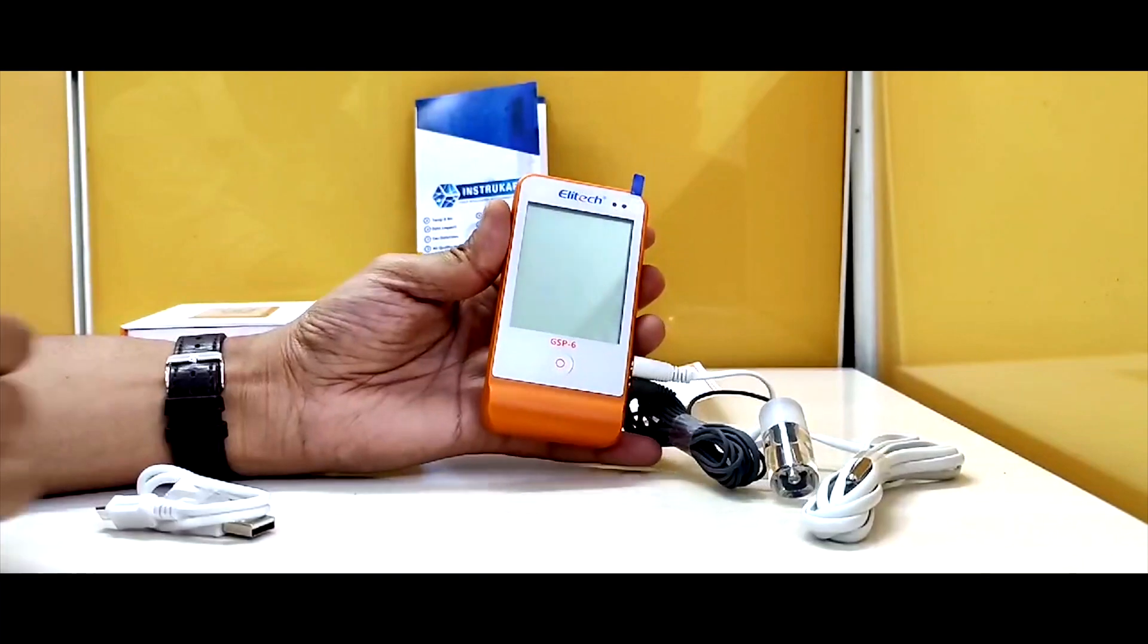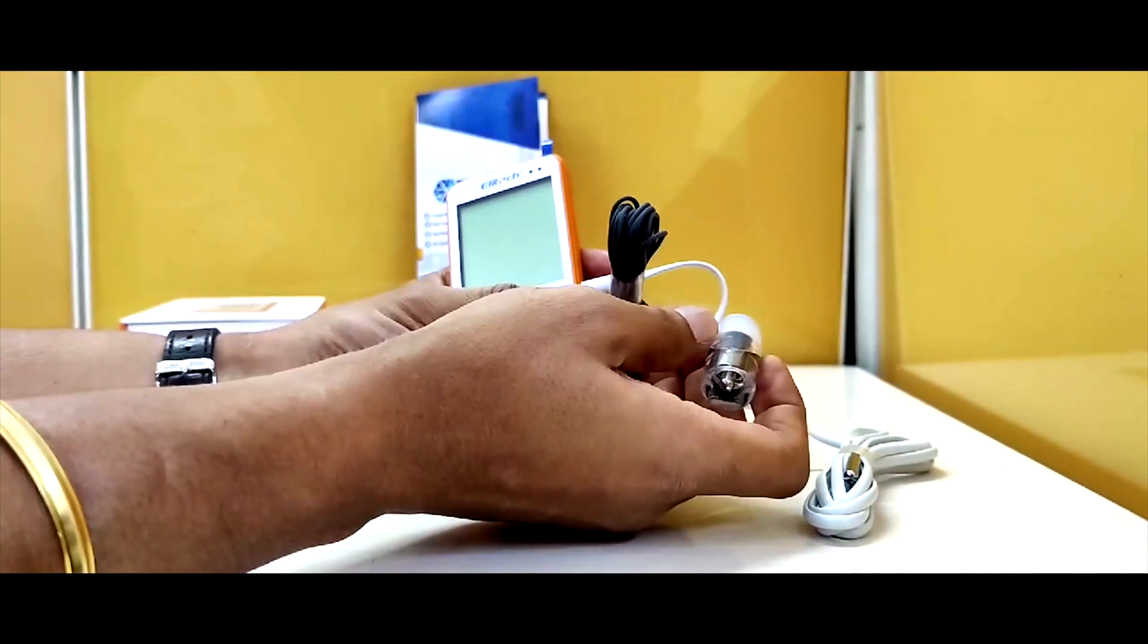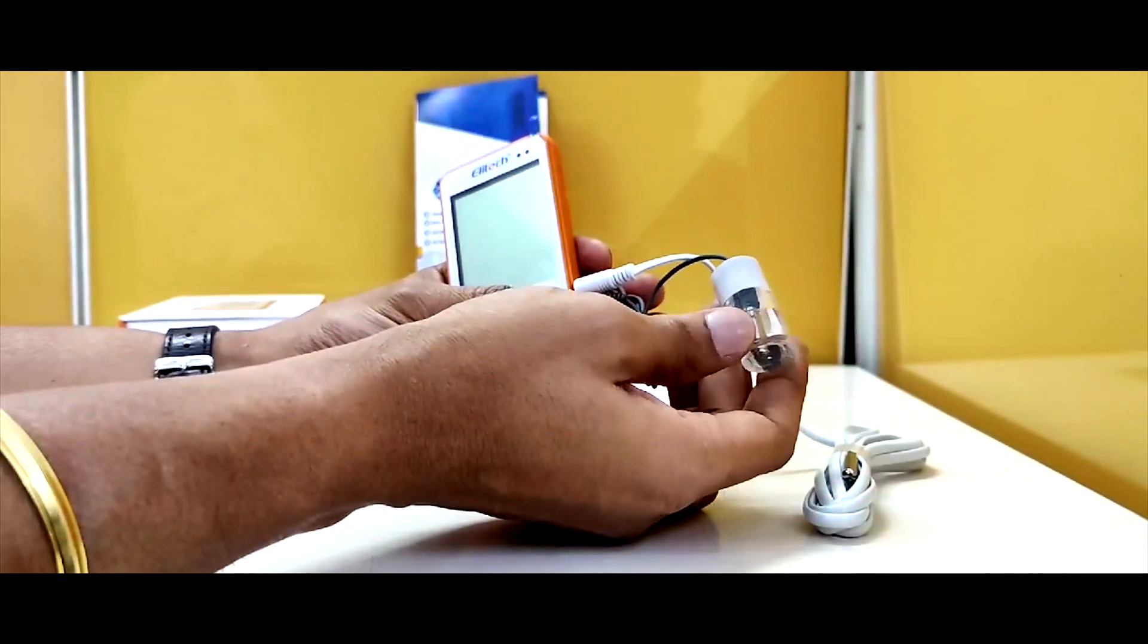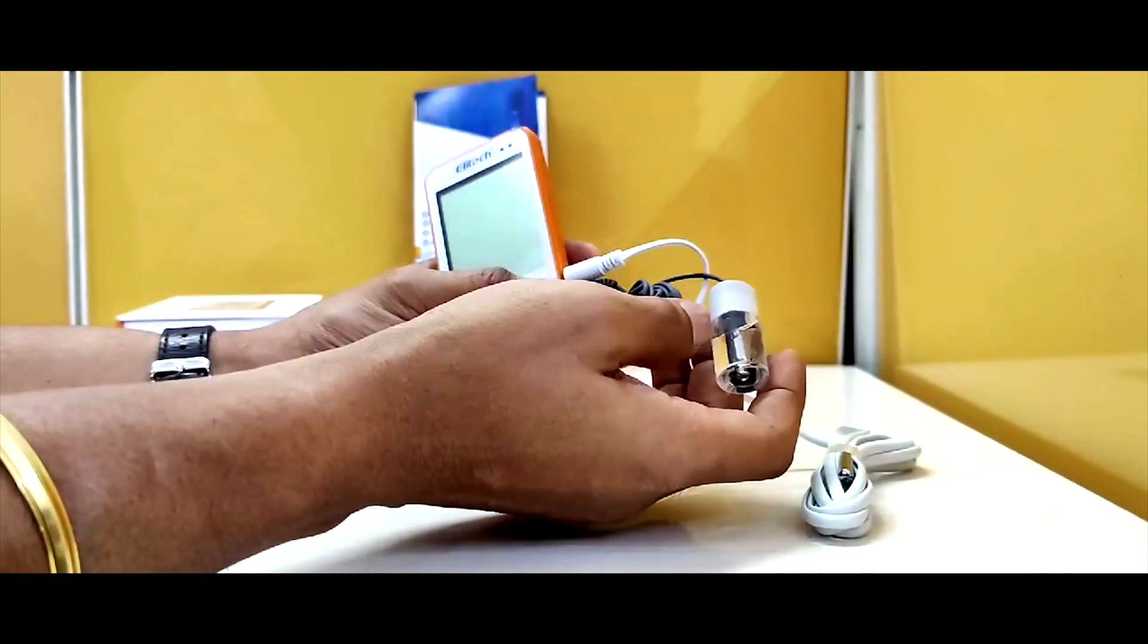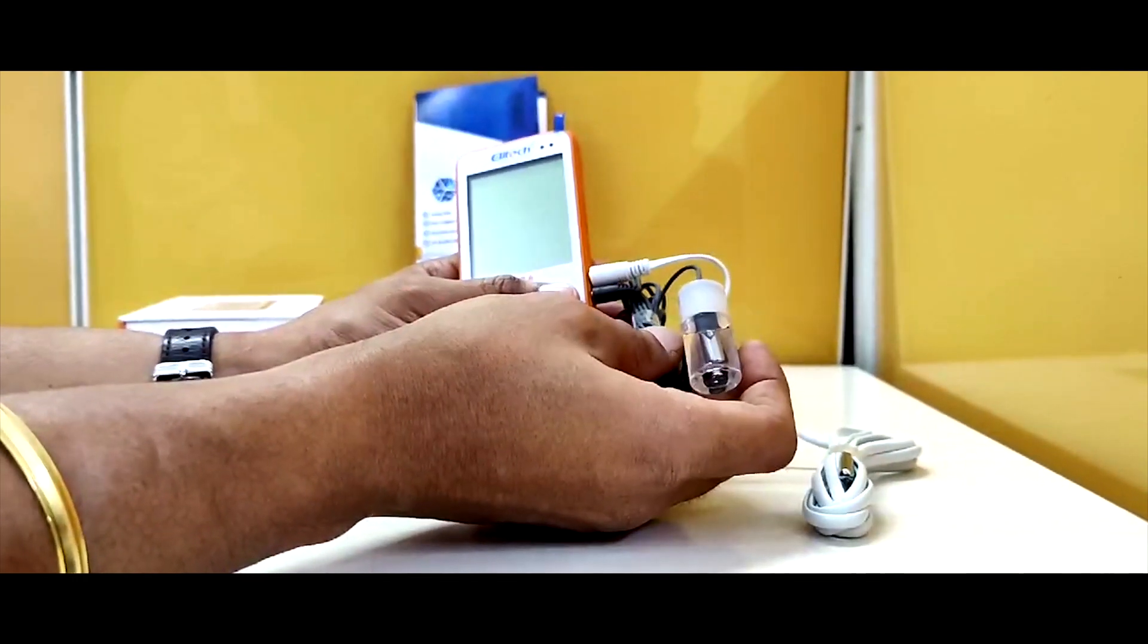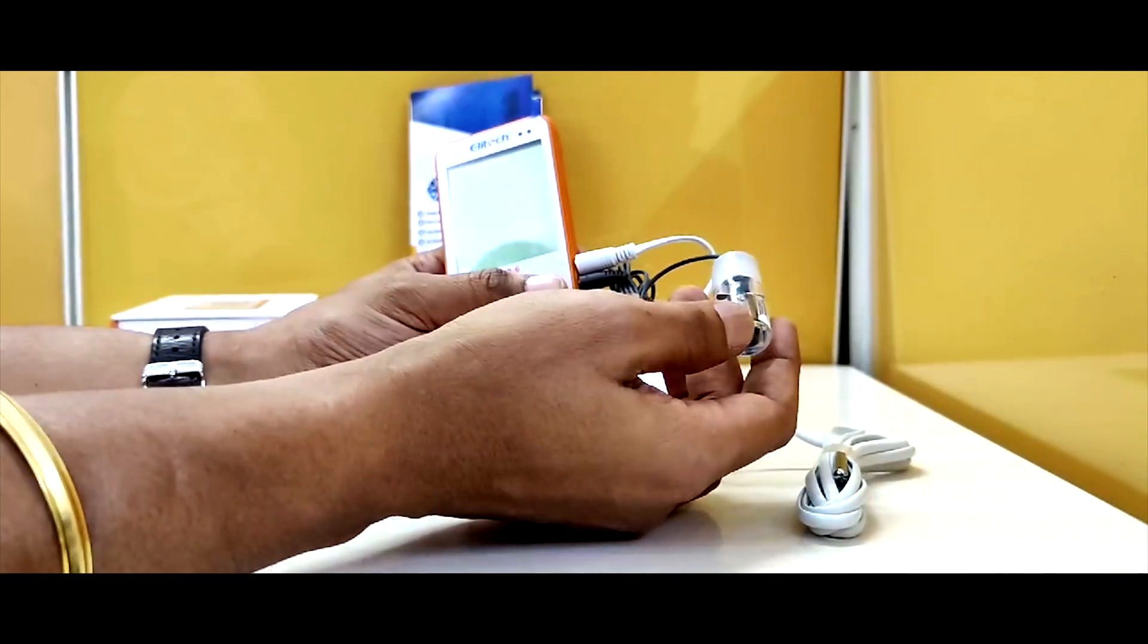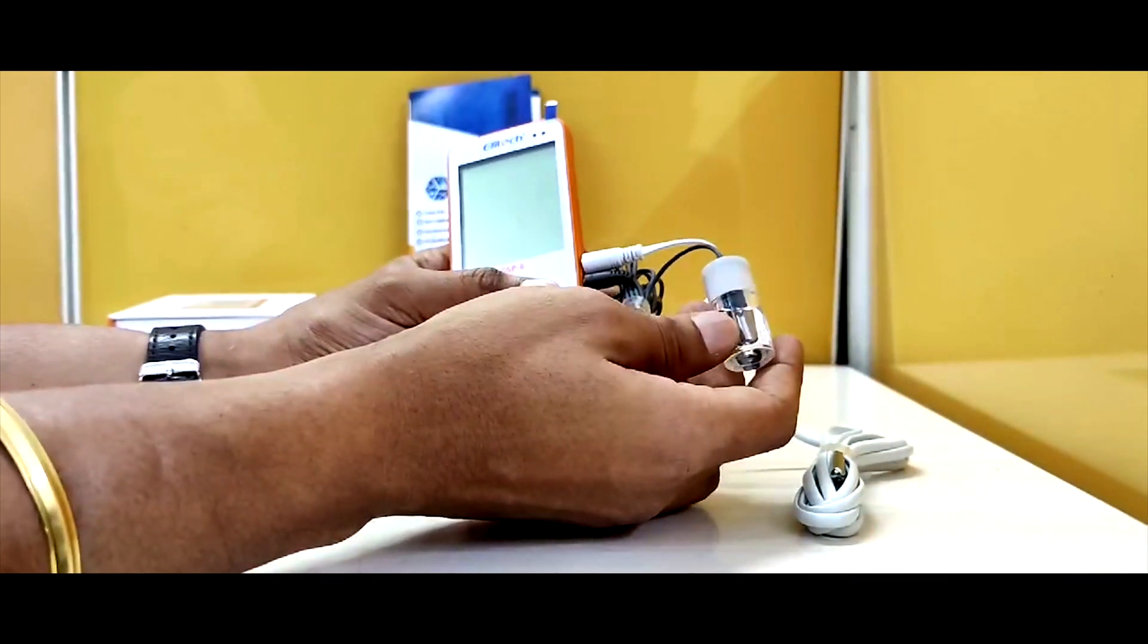Now the basic difference between 6 and 6G is this temperature probe. The 6G comes with a glycol bottle. This glycol bottle is basically used at certain applications where we have to check the vaccines or used in vaccine control, so that it simulates the same kind of temperature, same kind of environment.